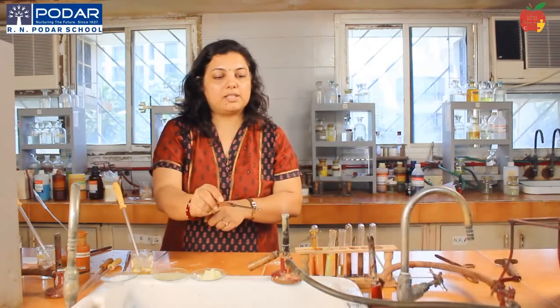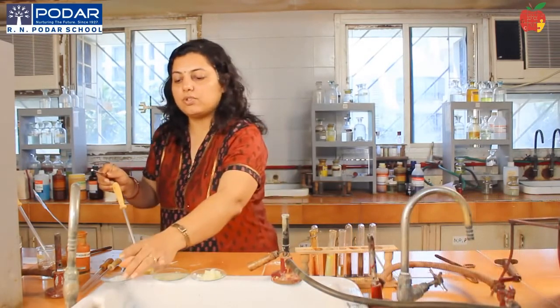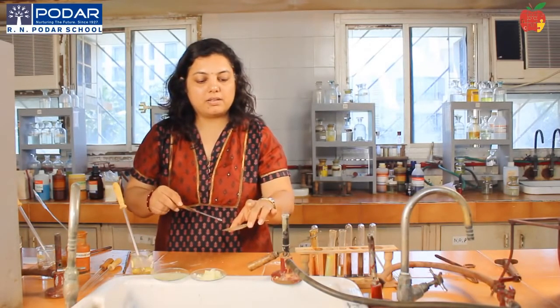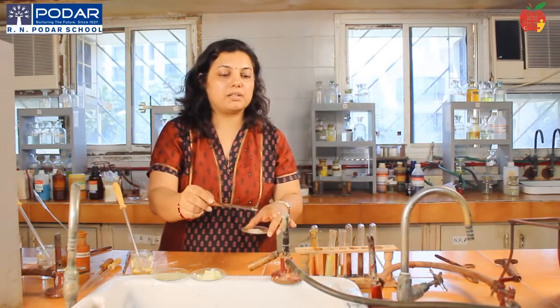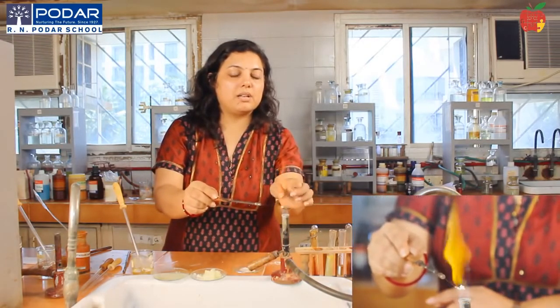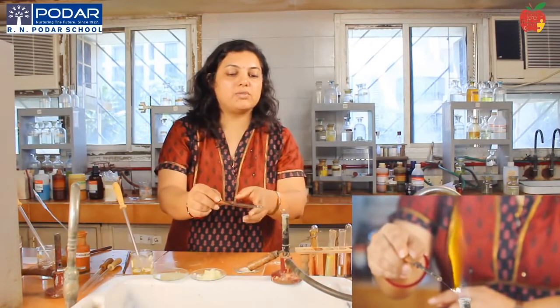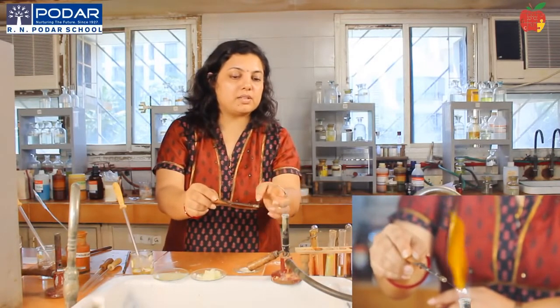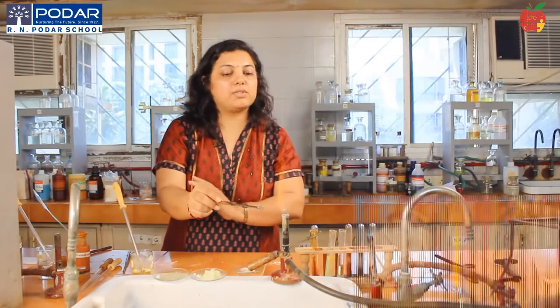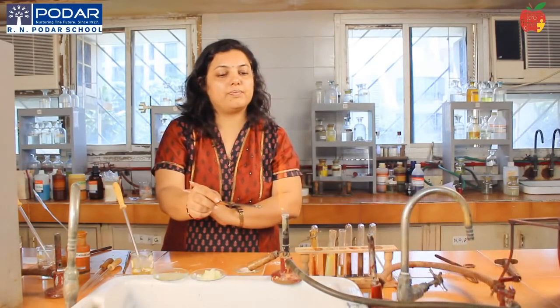Okay. Now let's see what happens with barium. So you will take your barium, add concentrated HCl, make a paste, and then you should get an apple green color. So you can see some streaks of green color coming. The reddish change is because we had used earlier salts, but you will get some streaks of green color in between, you're getting a green apple. So that indicates your barium.